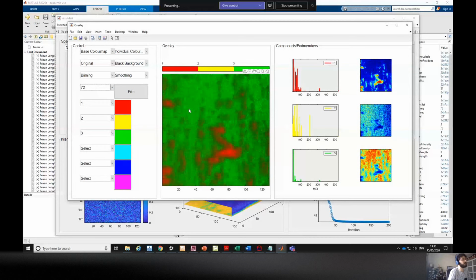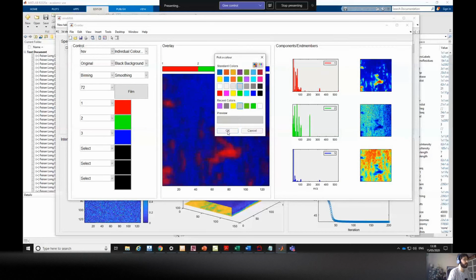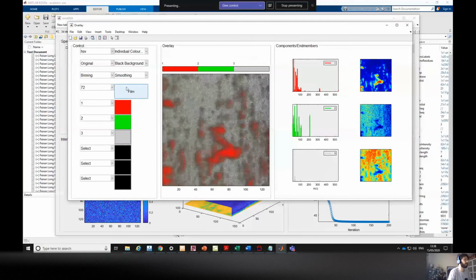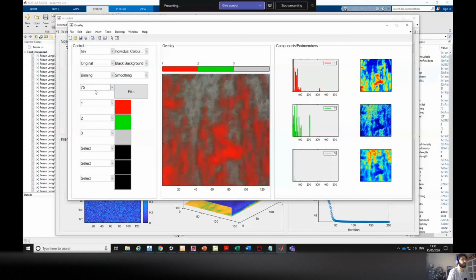So here, around here, when things are changing, you can overlay. Let's use the same colors we had before. Then you can see level by level things changing. You know, that's turning from the gray into the red end member.